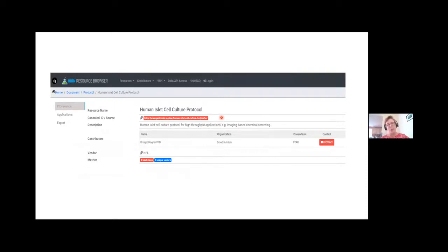It goes through exactly what I've told you today, and hopefully it'll be really useful for you to test your own conditions. It doesn't have to be compounds. It can be peptides or growth conditions, metabolites, anything really. I think that this is something that everybody should be doing, and it's also something that everybody can do, right? We have new people come into the lab all the time. And I think as long as you're careful with your process and have good hands and just go slow, this seems to work well, really almost regardless of the islet sample we get.